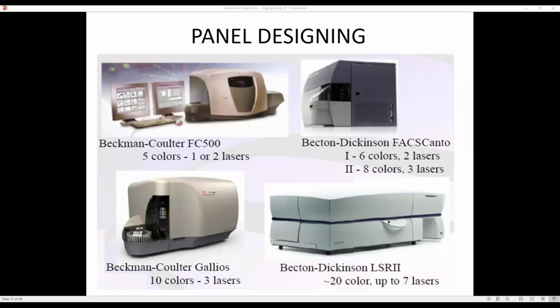It's inevitable. Though you have a beautiful compensation matrix set, there may be a need to do post-acquisition compensation, but you should not take so much time. If you're spending half an hour on post-acquisition compensation, it's not right. Maybe 1 minute, 2 minutes, just to check the data is all good and nothing is skewing, then that's fine and you can go ahead.